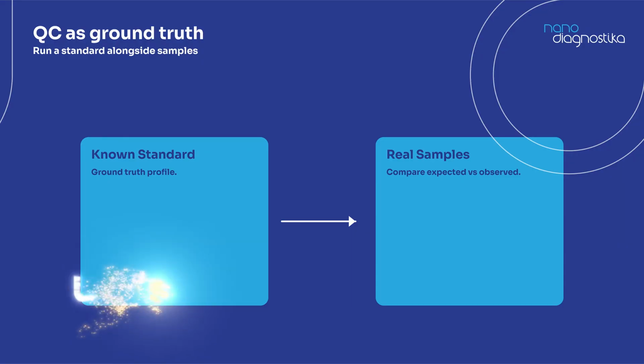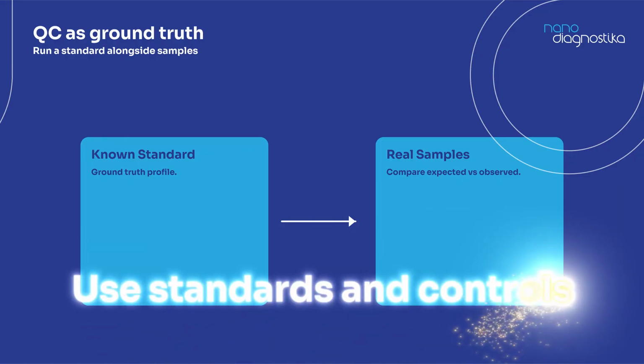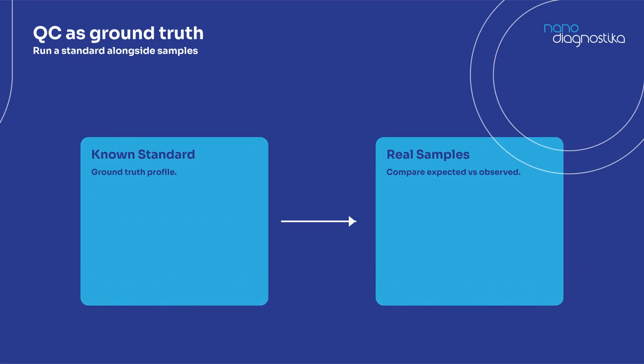How do we tackle bias? The solution is to use microbiome standards and controls as reference points. The principle is simple. Run a well-characterized mock community of known composition through your workflow to see how the outcome compares to what it should be. These standards are used in parallel with real samples as quality controls, so any deviation in the standard's results flags a bias in the process.